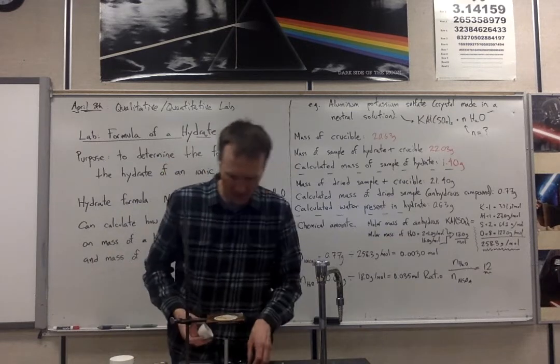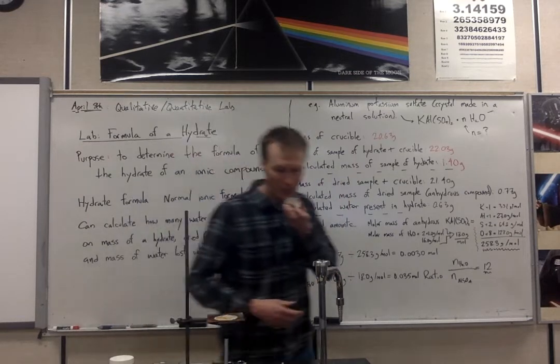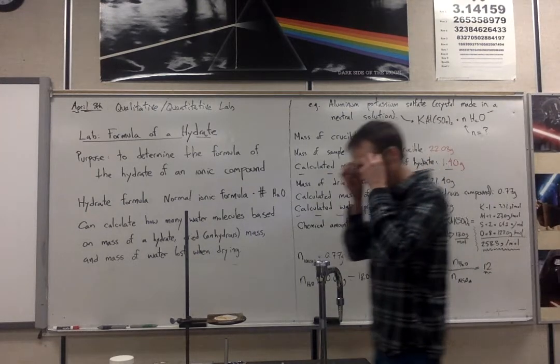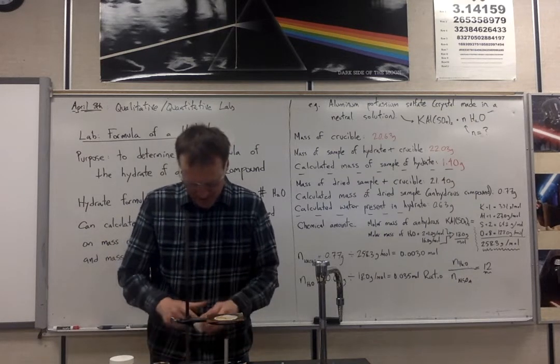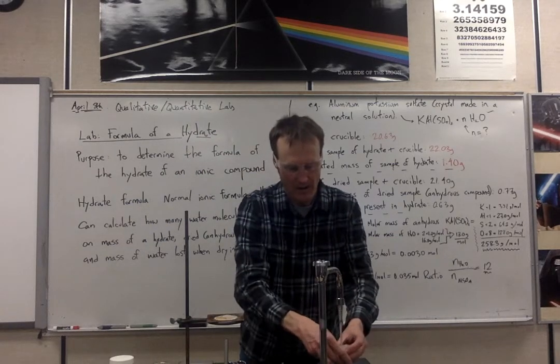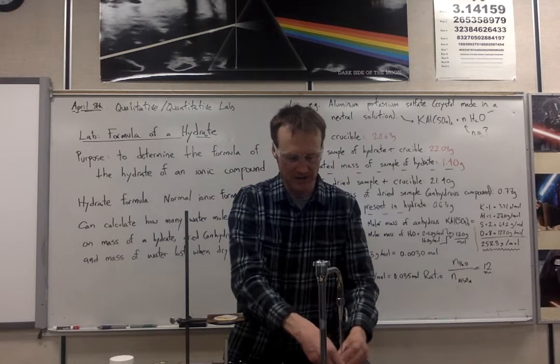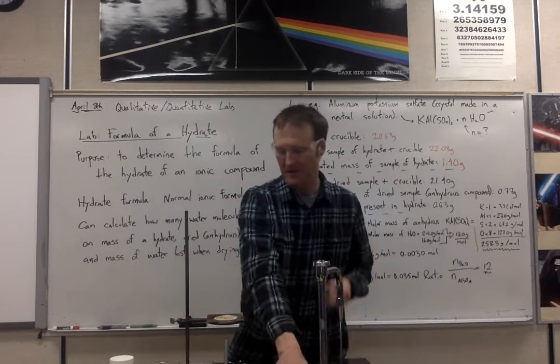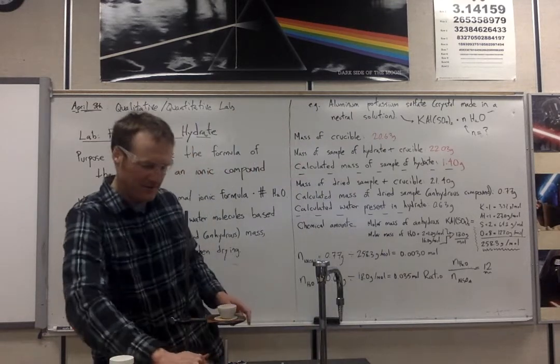And we'll get our measurements. First of all, I don't expect there's going to be any change in the mass of my crucible. I'm going to clean it because that's what you should do, and then I'm going to make sure it is dry by putting it on the Bunsen burner. If I was better at managing time, I would have a second crucible, but these don't take long to dry out.